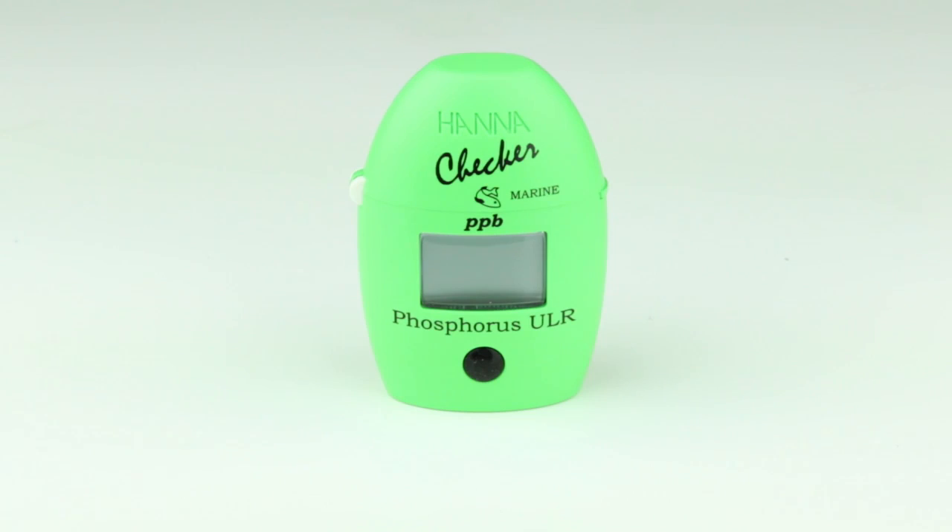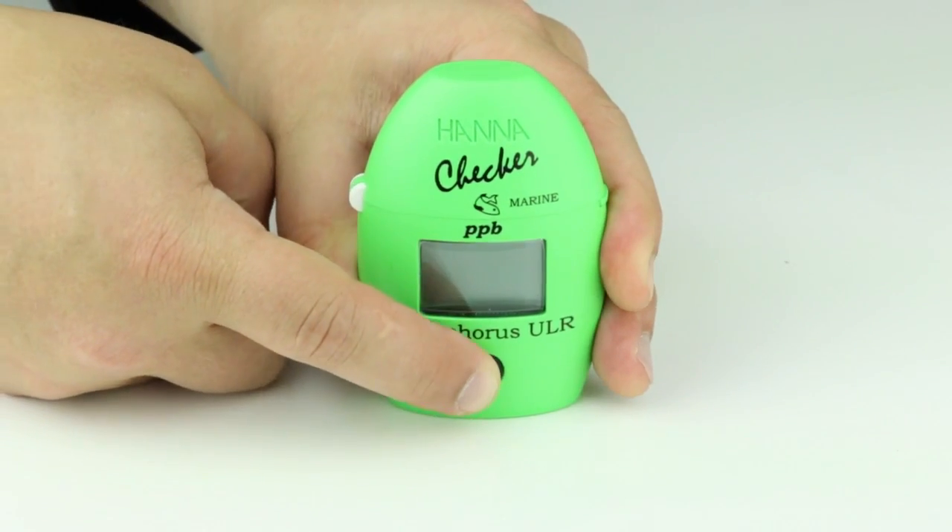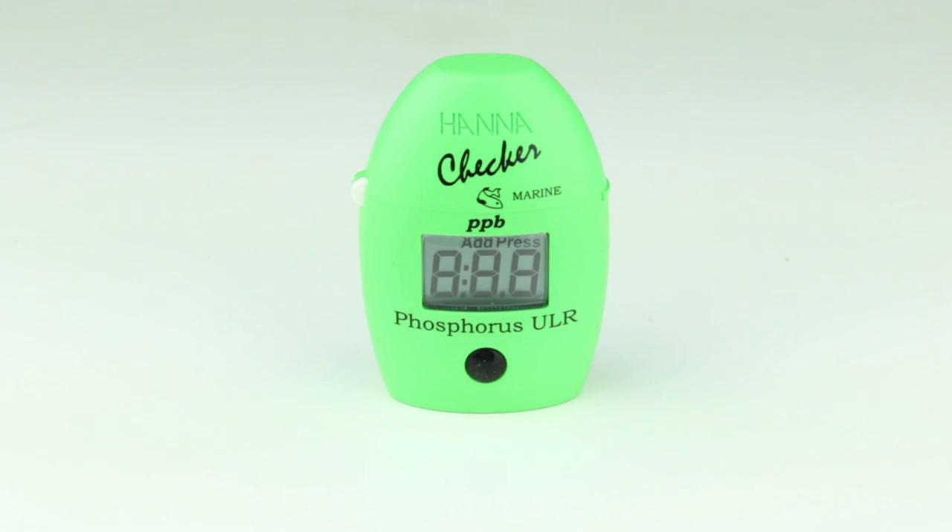The HI736 is designed to make testing quick and easy. Press the button to power the meter on. Notice ADD-C1 appears on the screen. You are now ready to begin testing.